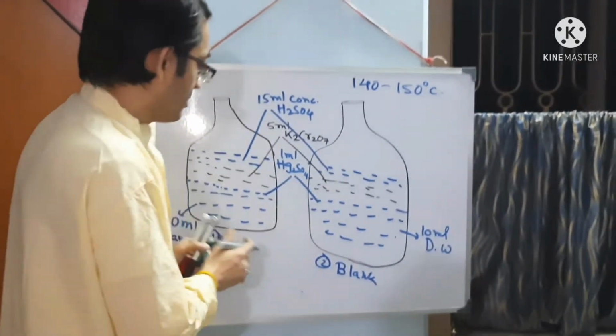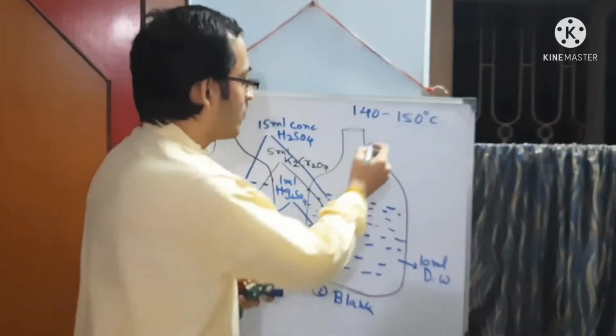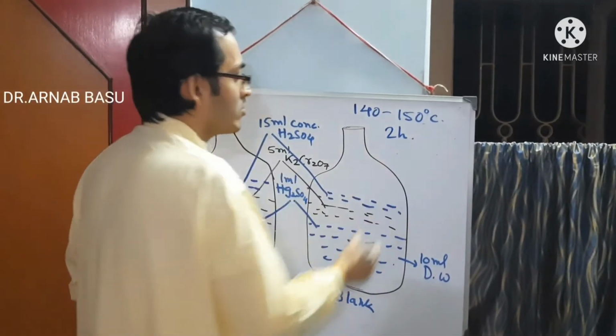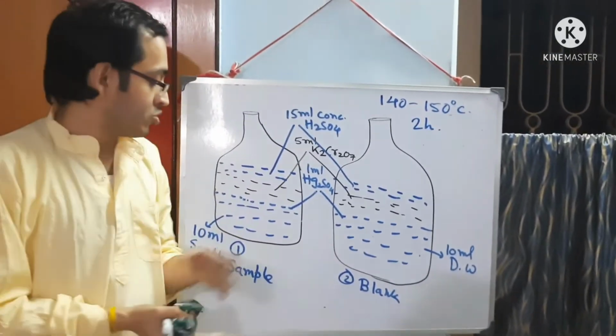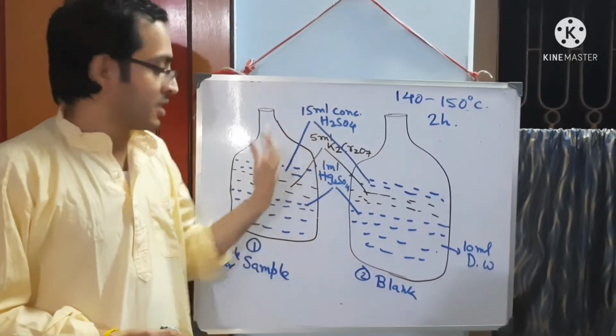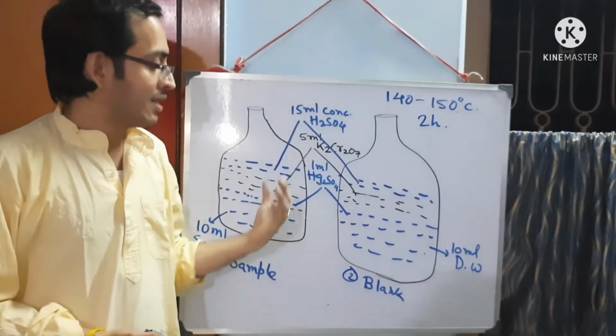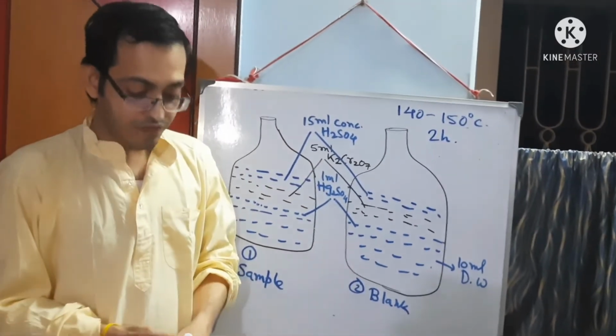These 2 flasks are kept there for 2 hours. Then after 2 hours these flasks are taken back and cooled.